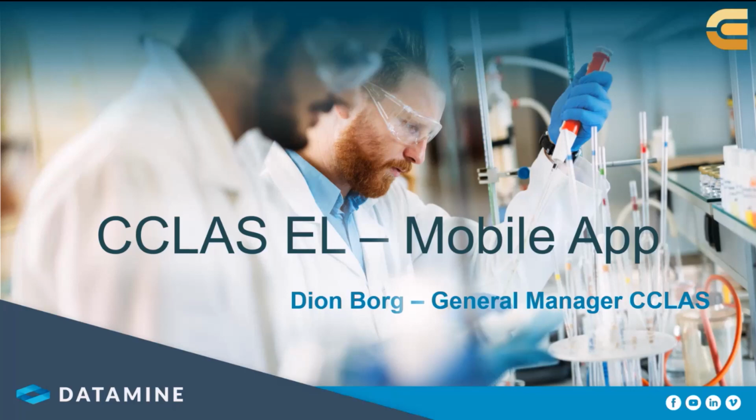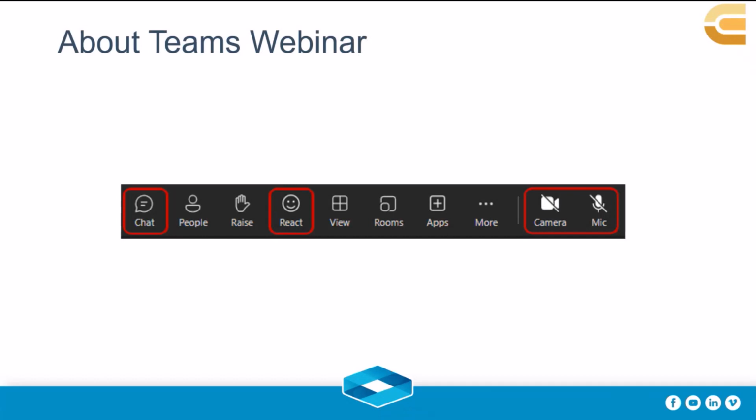My name's Dion Borg. I'm the General Manager for CCLAS based in the Datamine office in Brisbane. And today I'm just going to be presenting our new mobile app for CCLAS EL. All right, let's get started.